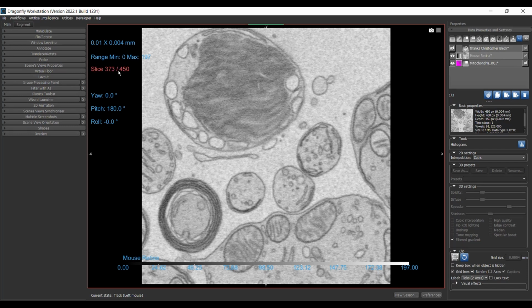I'm not going to use the entire 450 slices, out of which I'm going to use only 5 slices for training. Slice number 10, then the 100th slice, and every 100th slice after, and hence I have only painted those 5 slices. You can see this. Let's go to slice number 10.